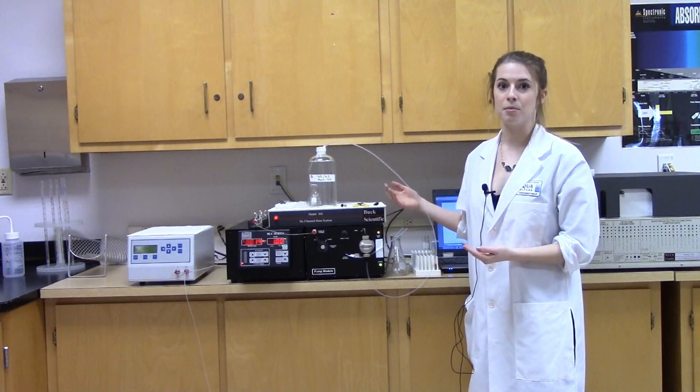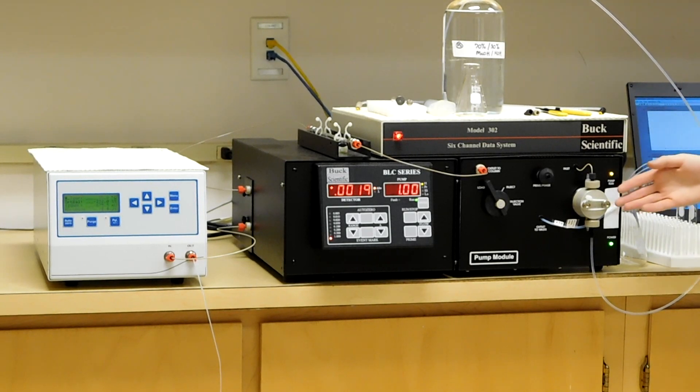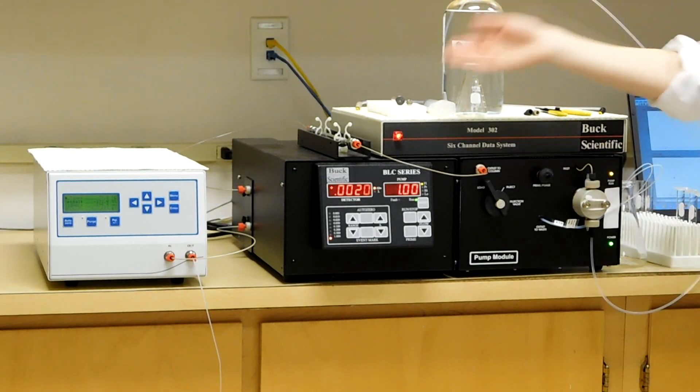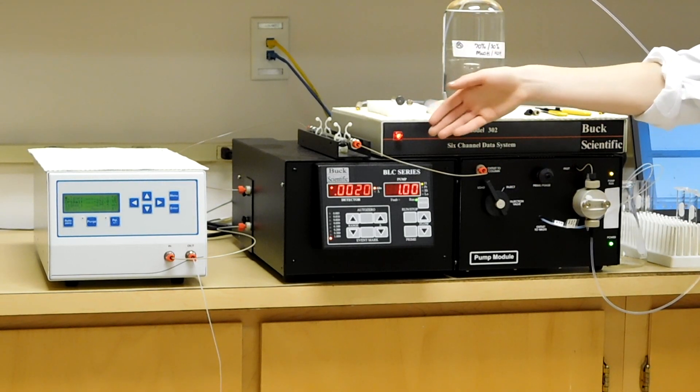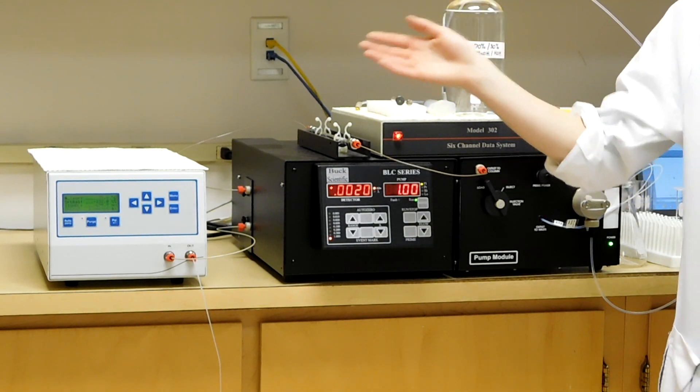Next, we have the data system collector. This processes all the data. Down here, we have the pump, which is pumping the liquid through, and the injection port, where we put the sample into. Then we have the UV-Vis detector, which analyzes the solution, and the refractive index detector over here.